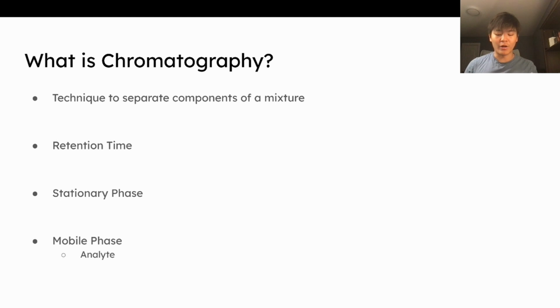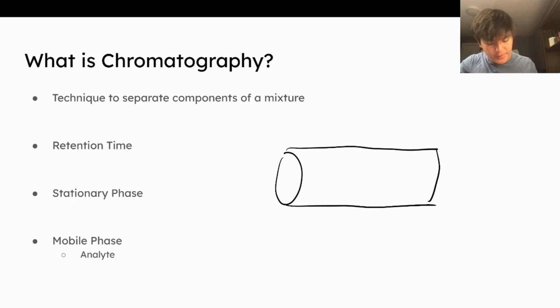What we want to see is how long this protein will stay in some matrix. So imagine we have a matrix here, and we throw a bunch of proteins there, and then some protein leaves. I'll give you an analogy. Imagine we have a little tube here, and people are going through this tube. Let's say we want to filter out these people somehow. Well, we just have to make this tube have some sort of property.